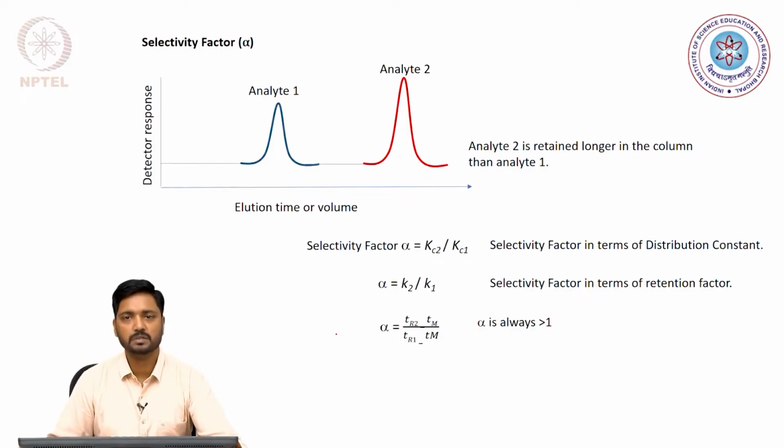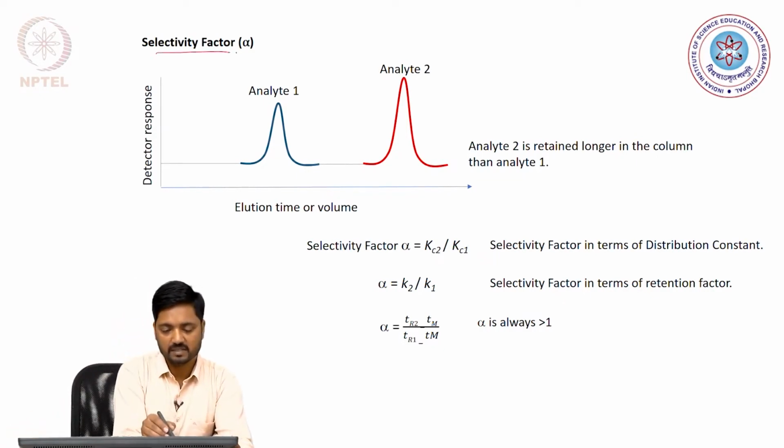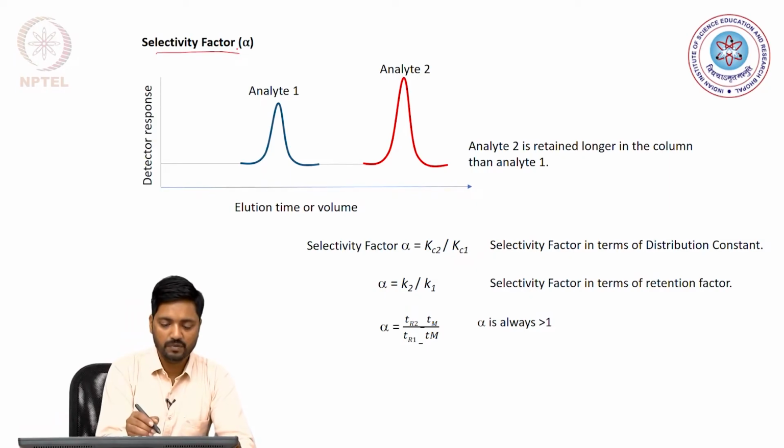Now, let us get introduced to the concept of selectivity factor. This selectivity factor is the term that comes into consideration when we are considering two analytes or more.